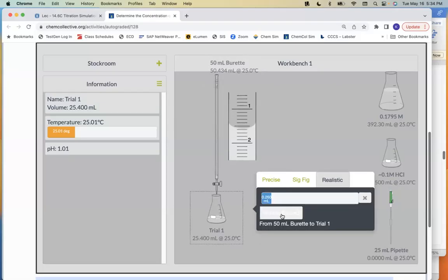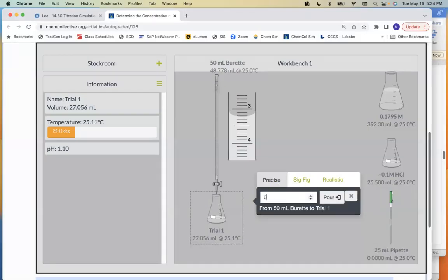And the problem with the first trial is that I don't know where the endpoint is. So trial 1 could be your quick and dirty trial. You can do tedious. You can do like 0.05 ml and just keep clicking in tiny, tiny quantities until the solution turns pink. That can be very frustrating because it will take a long time. I'm aggressive. I go by 1 ml. And that's because the first trial is my quick and dirty trial. I just want to roughly know where it is.